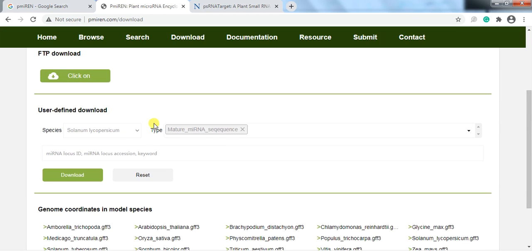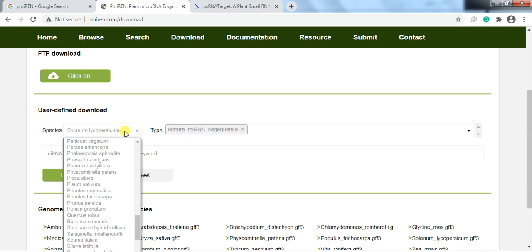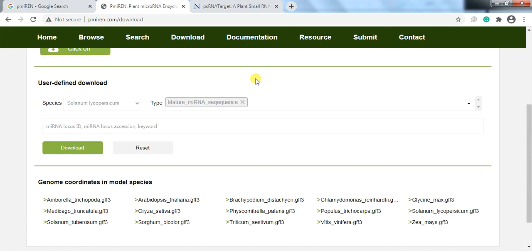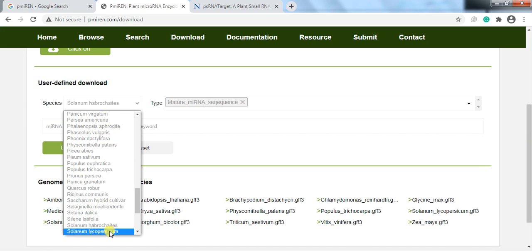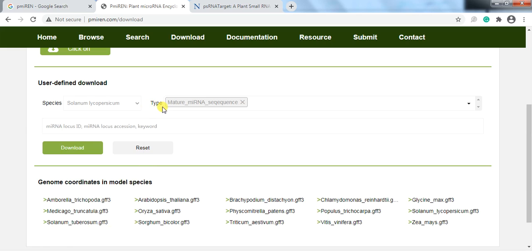Here, under 'User Defined Download,' select the species in which you want to find the microRNA. I need Solanum lycopersicum, so I search and select it. Then choose what type of RNA sequence you want for Solanum lycopersicum.